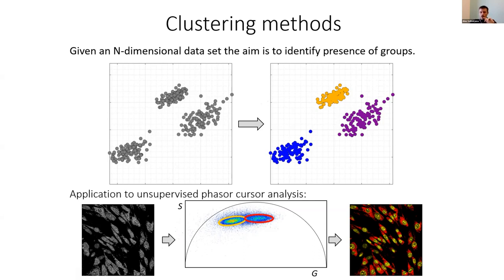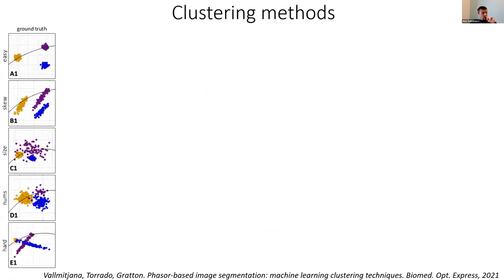So we started to develop this technique early on, I'd say just before the pandemic. And it's computational work, so we could do it from home. It's based on simulated data at the beginning, and then with Belen, we prepared some samples to test it, but everything was done offline at the beginning, right?